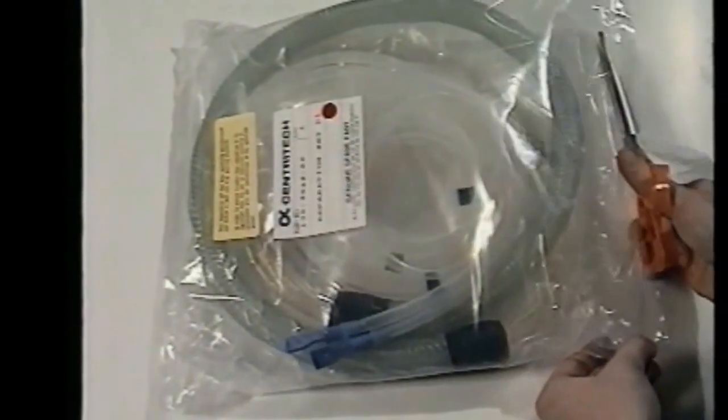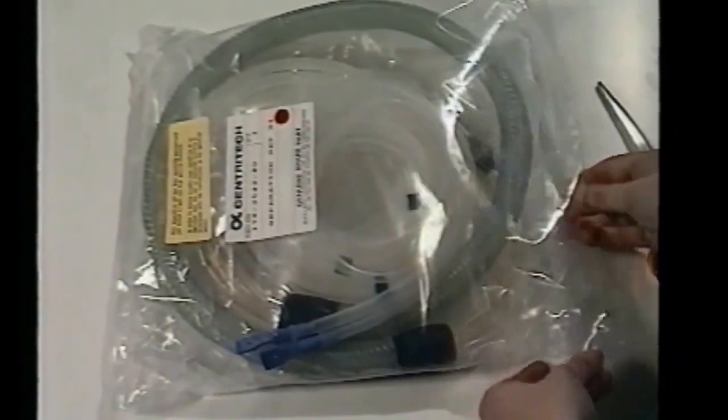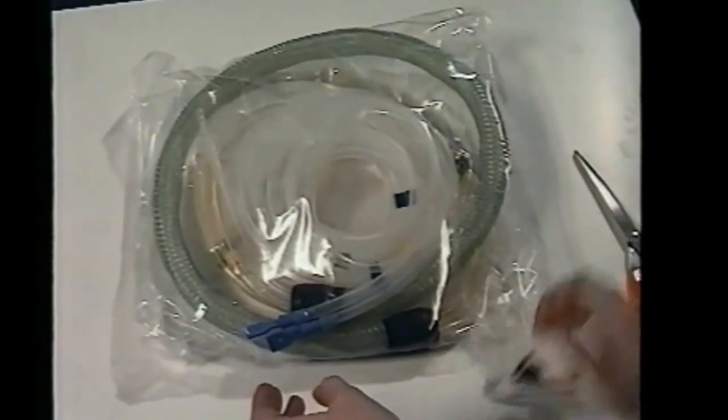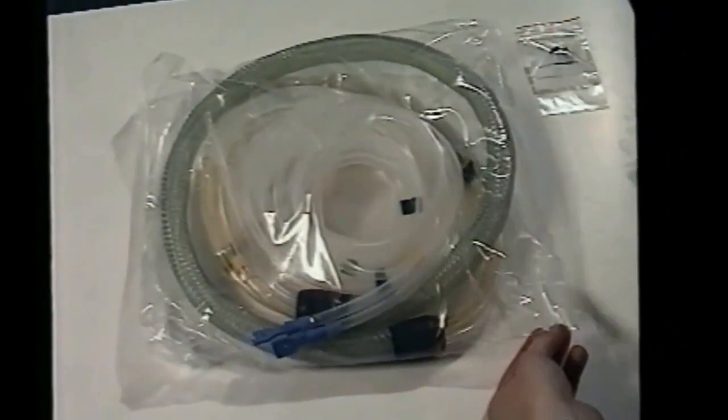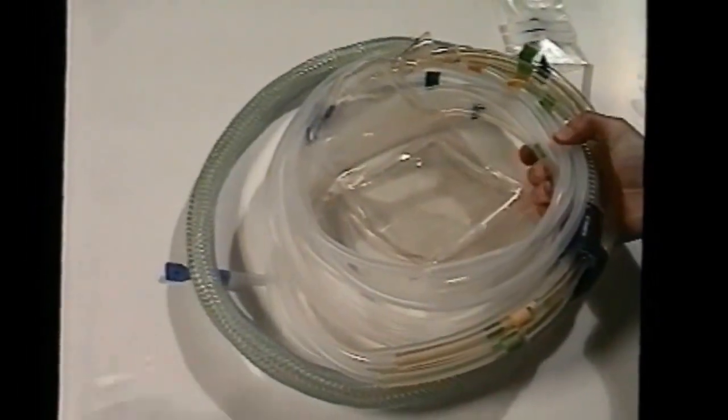The Centritech cell has a comprehensive range of features. The bladder and tube assembly is made from medical quality materials and is supplied as a totally sterile unit, ready for connection to the external system while taking the usual precautions to maintain sterility.